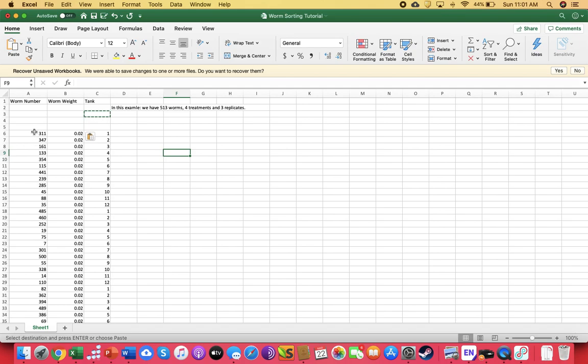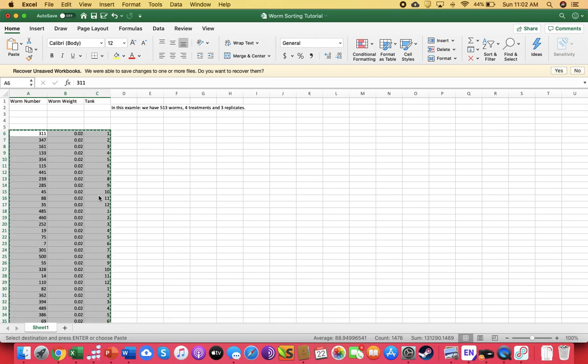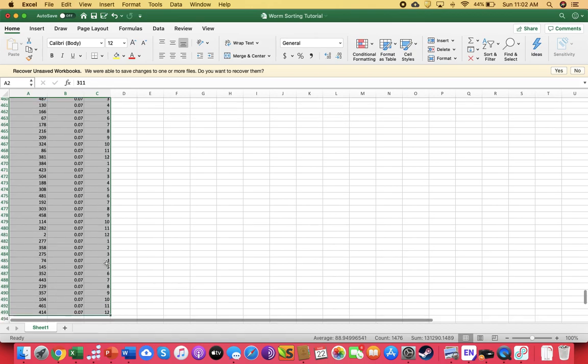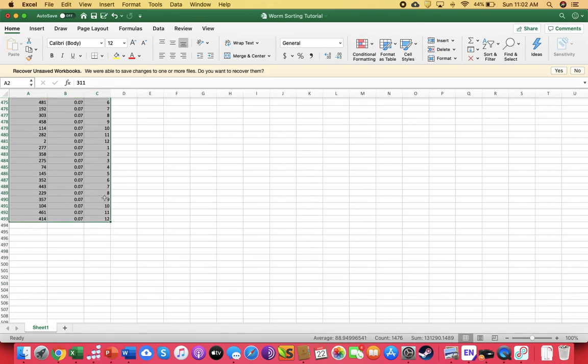Waste not, want not. Okay, what I'm doing here is I'm holding down Shift, holding down Command, and doing my down arrow. Got my whole data set: copy, cut, paste. Okay, and now you can see that we've got a nice, neat data set. It should go from 1 to 12. It should end on 12, which it does, which is nice.